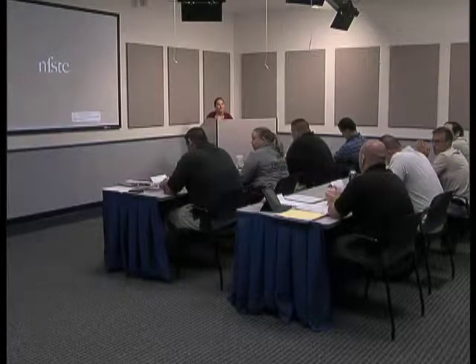Just for the benefit of knowing, if a responder were to go out and sample with a PSPME, and we're bringing them back, maybe in a container out of a hot zone into an area where we would sample, what do you think that the PSPME will hold it for, let's say, the time it would take us to get back through, maybe even a decon, maybe 20 minutes? We've done experiments, and we do find that for certain compounds, it does hold it enough, 15 to 20 minutes, and that is without a cover on it.